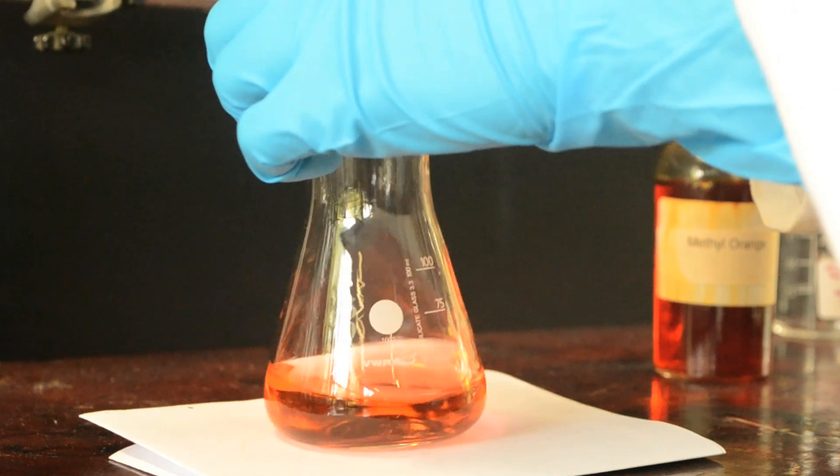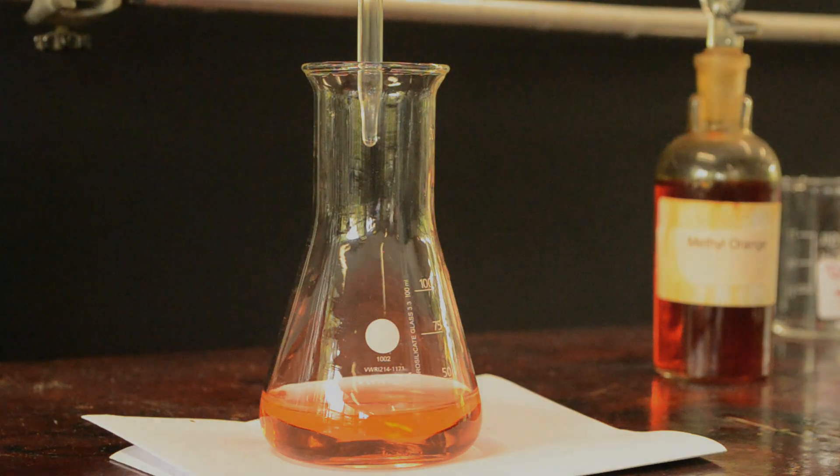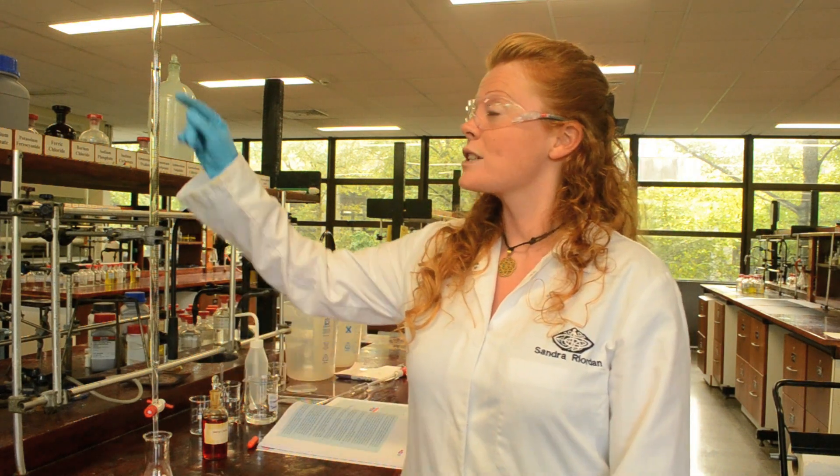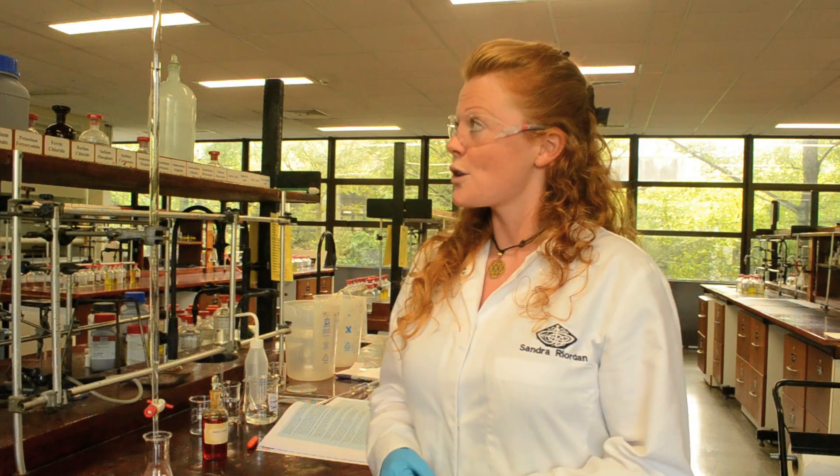And now I have found the end point of the titration. We've completed the first rough titration and I'm going to take the measurement to see exactly what volume of acid was required. We will now repeat the titration a number of times until we get at least two titres with values within 0.1ml of each other.